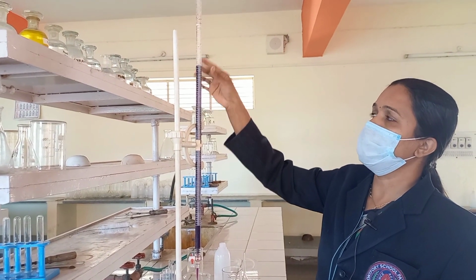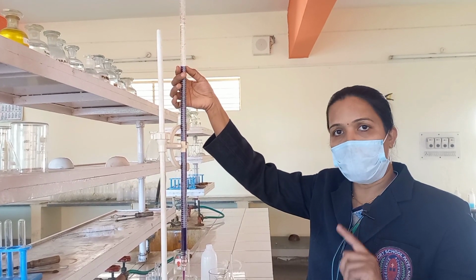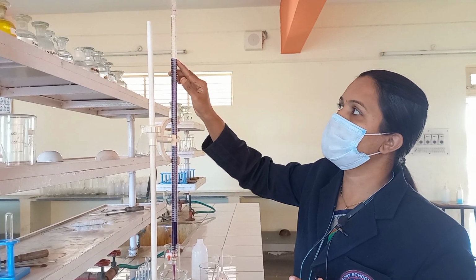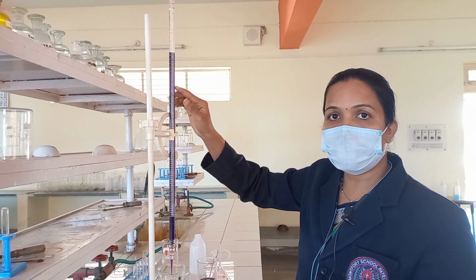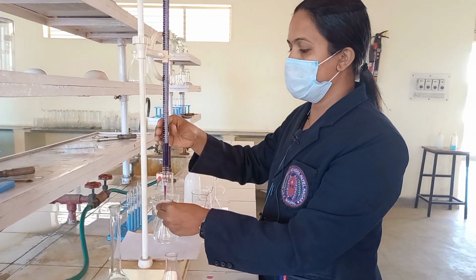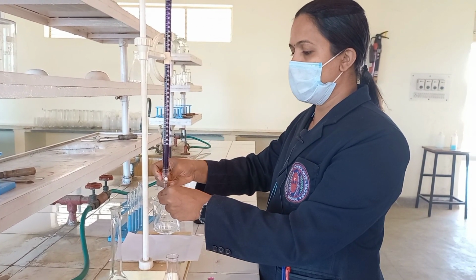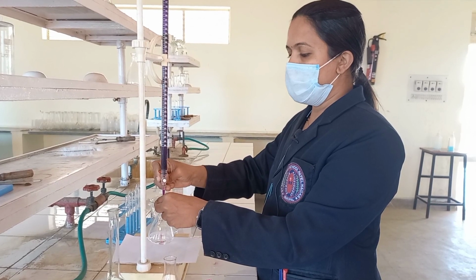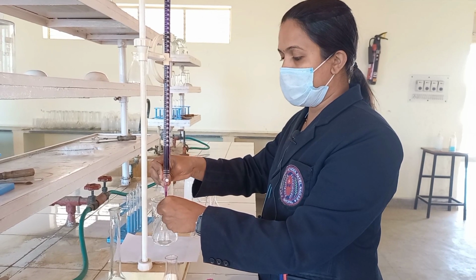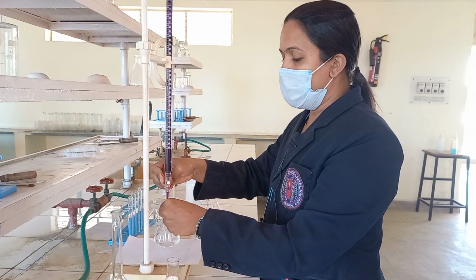Now the second time, what you have to do, first of all, either you can fill it up to the 0 mark, or you can start from where you stopped after the first reading. Right? So if you are starting from here, then this will be your initial reading. Now I am not filling it again, so that will be the initial reading, and then I will again do the same procedure as I did for the first reading. I'll start pouring the KMnO4 into the flask, and at the same time I'll swirl this titration flask.